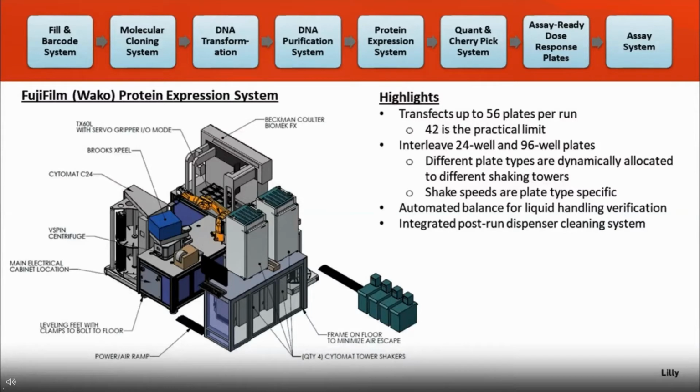When we go through our process, right now I'm talking about a 96-well process, and we're doing a little under 1 mil expressions on this system. We eventually get to a point where we triage these samples down and people need more material, and we'll purify samples. And so what runs on here is not just 96-well plates, but we also do 2 and 4 mil transfections and 24-well plates.